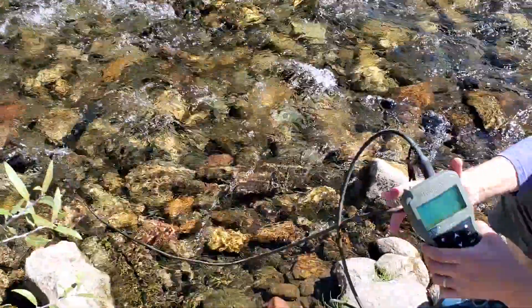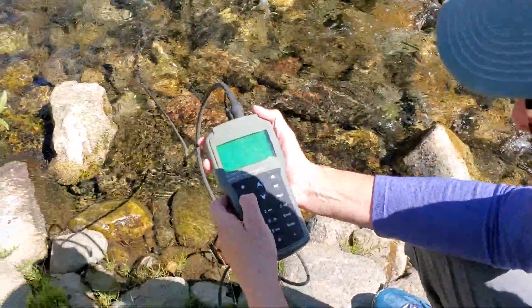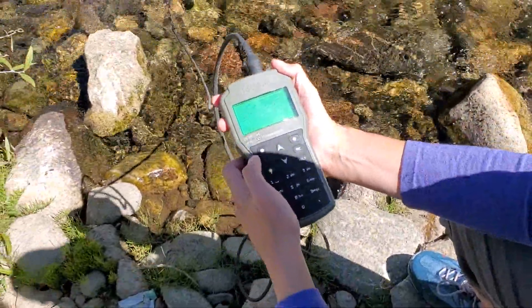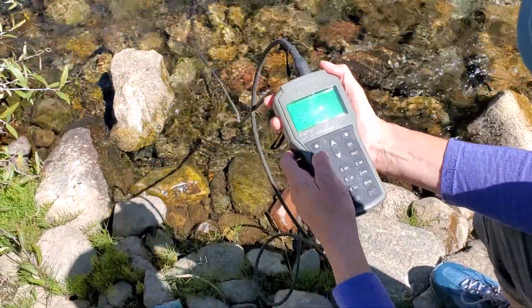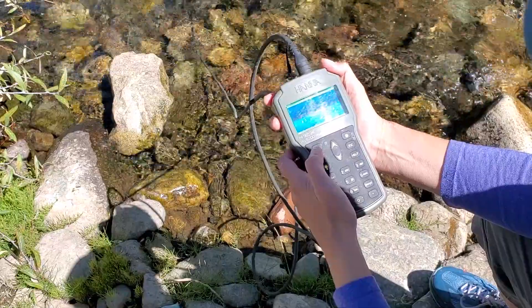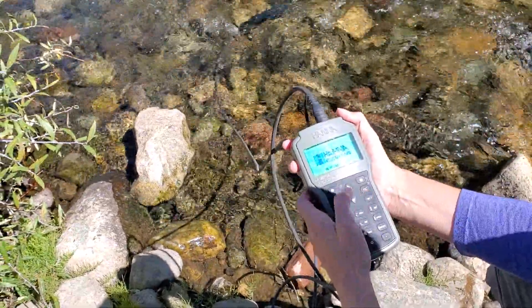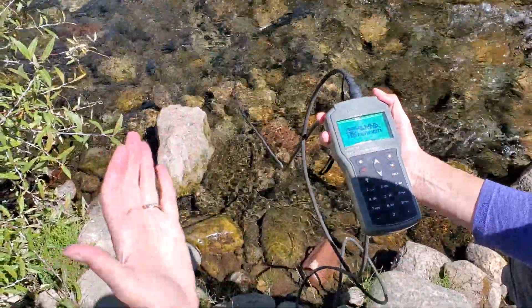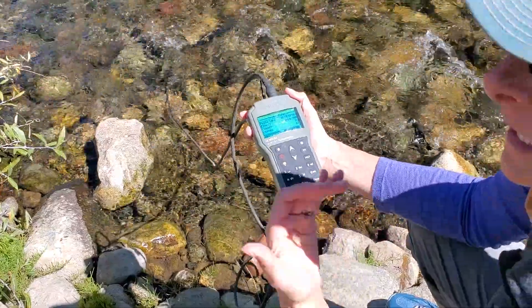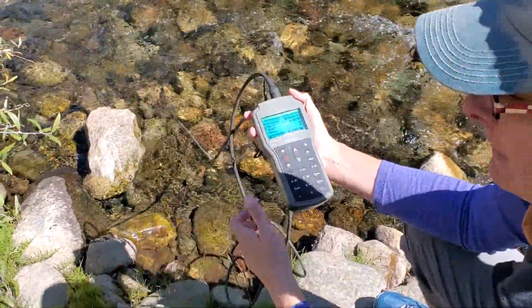We've got a meter that will collect the data for us. We're not going to get great data because we have our covers on our probes. We'd go through and collect our data digitally. We also will always write all of our data down on a paper log sheet to make sure we keep our data.